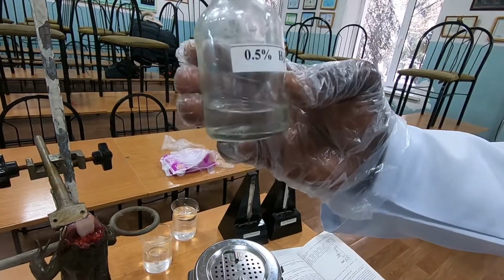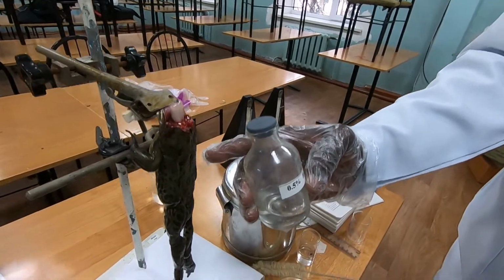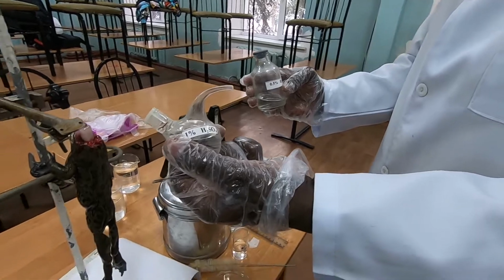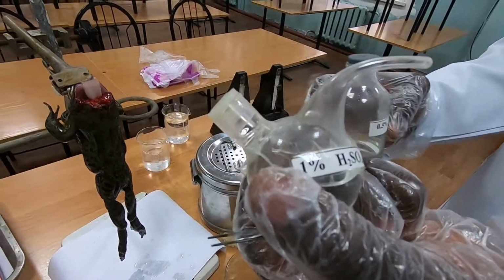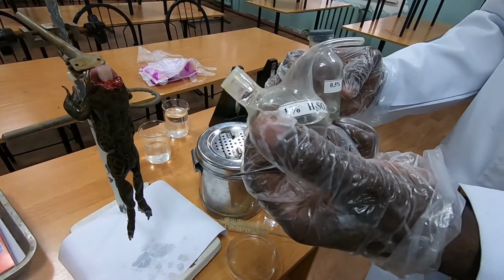But if you continue to use 0.5, there will be no reaction because the frog will get used to it. So it needs a higher concentration to have impact, to create reflex action.